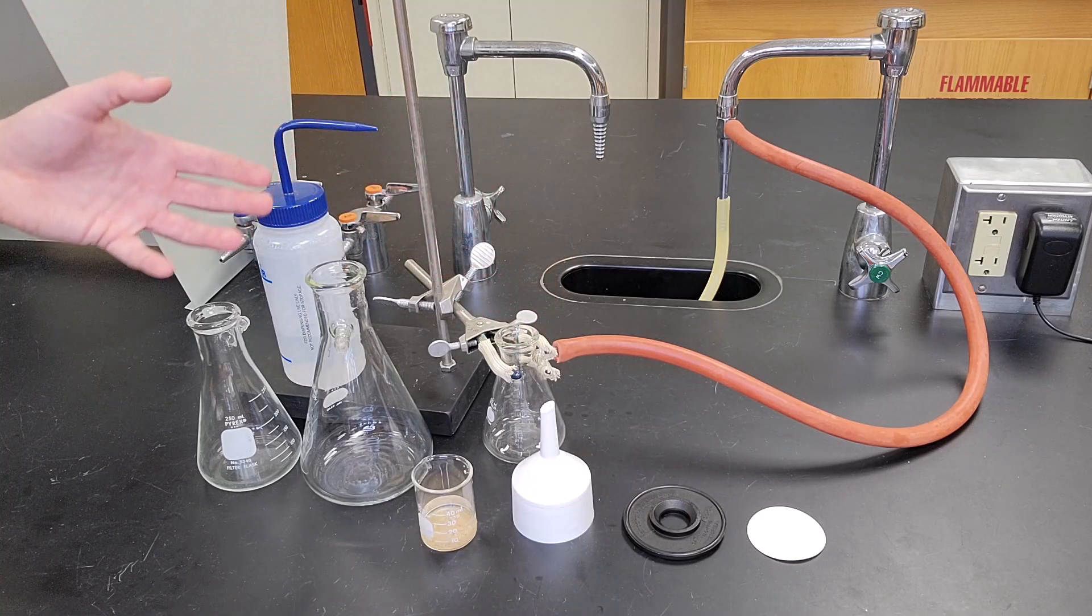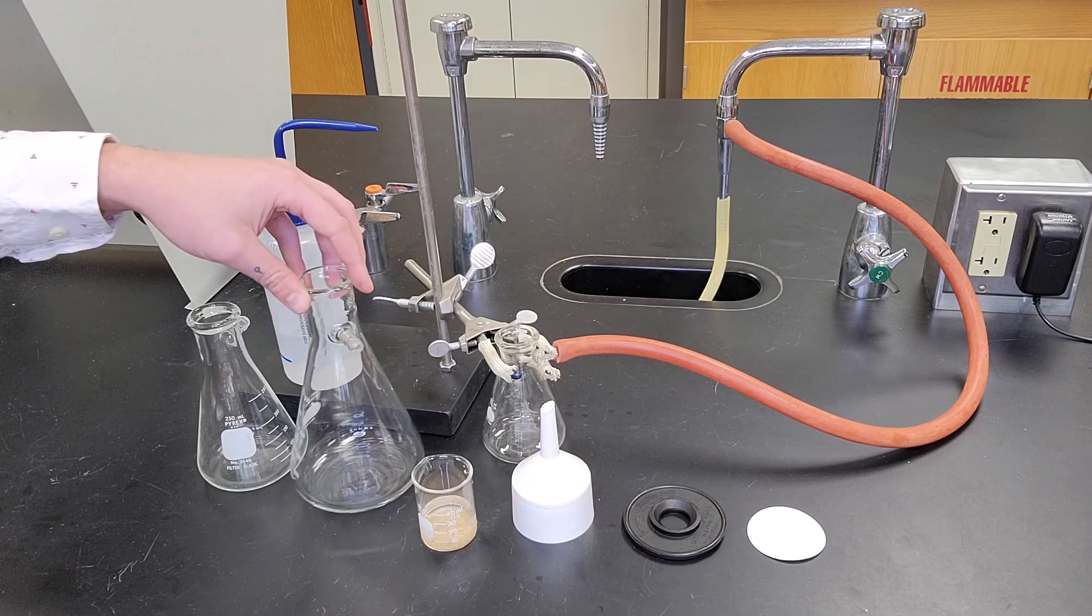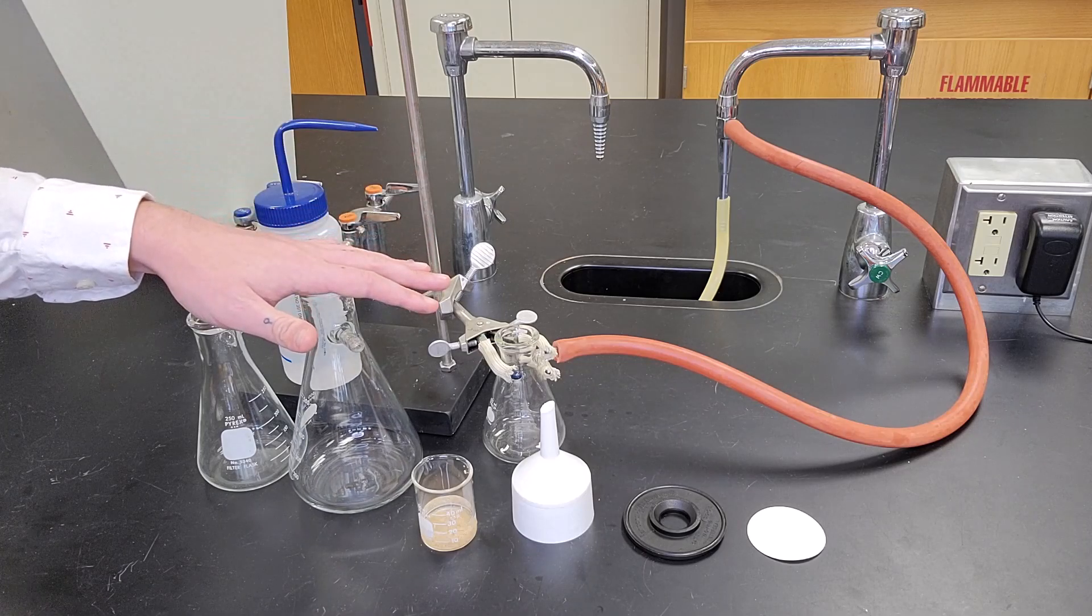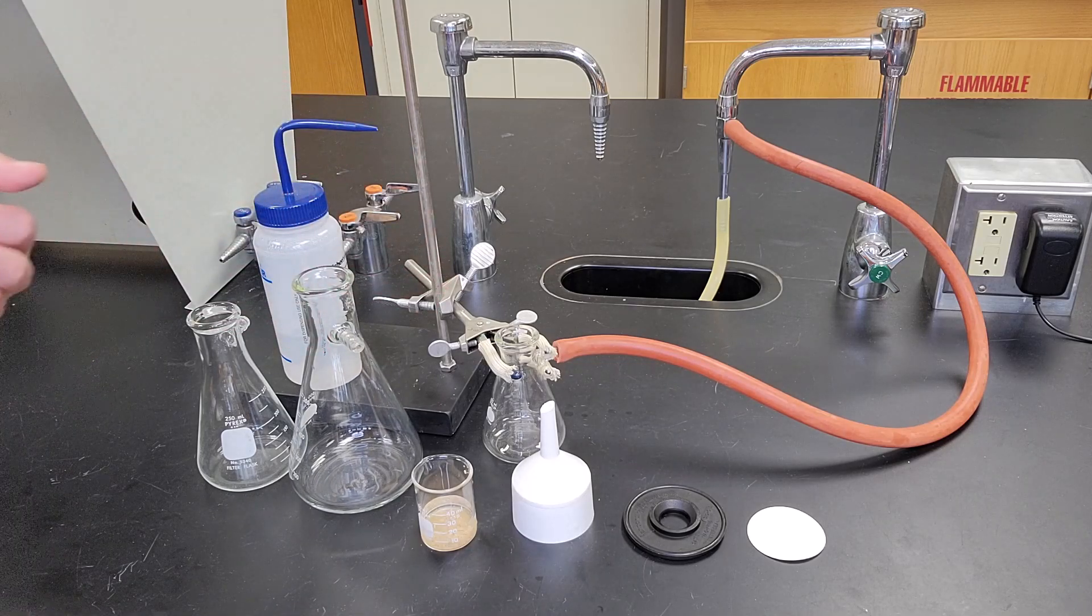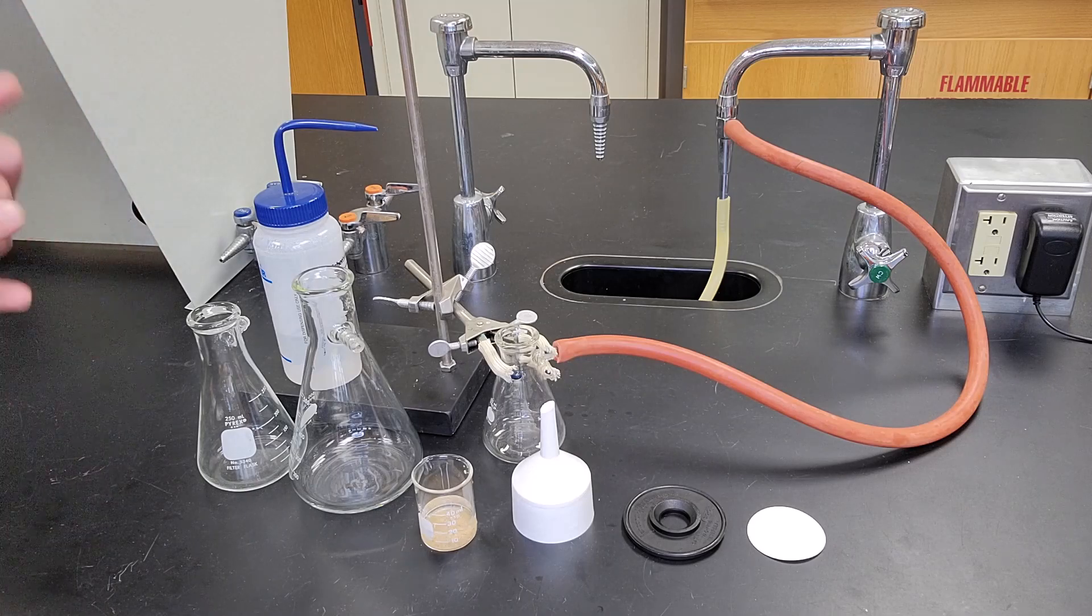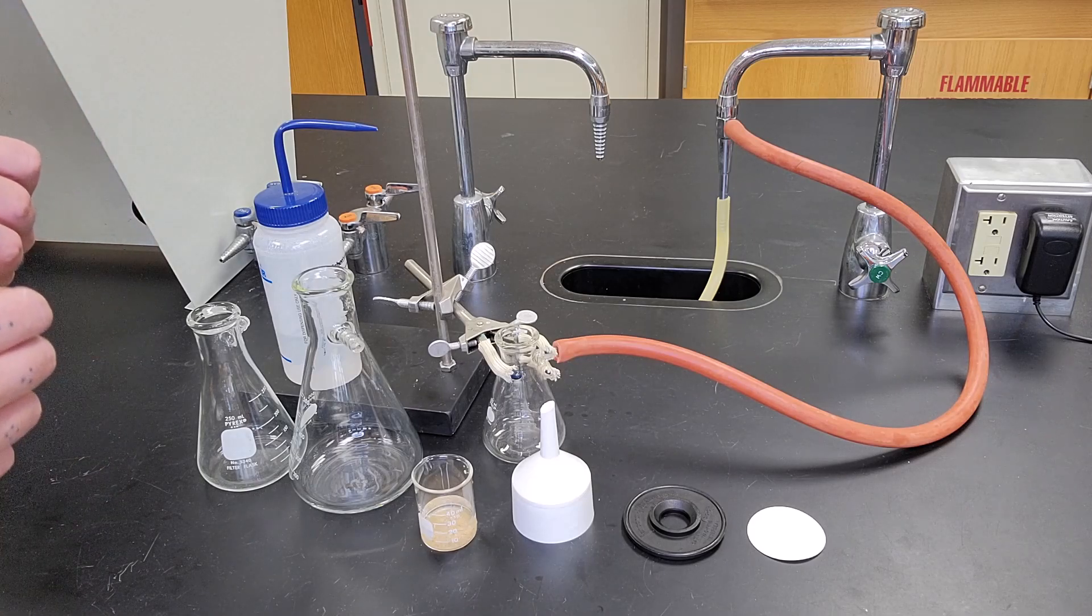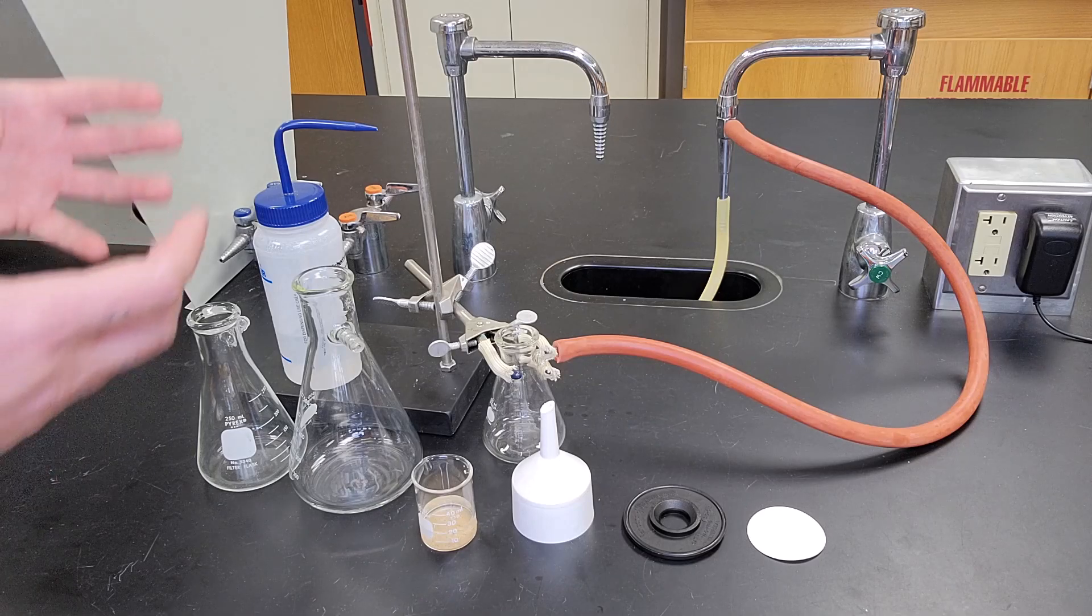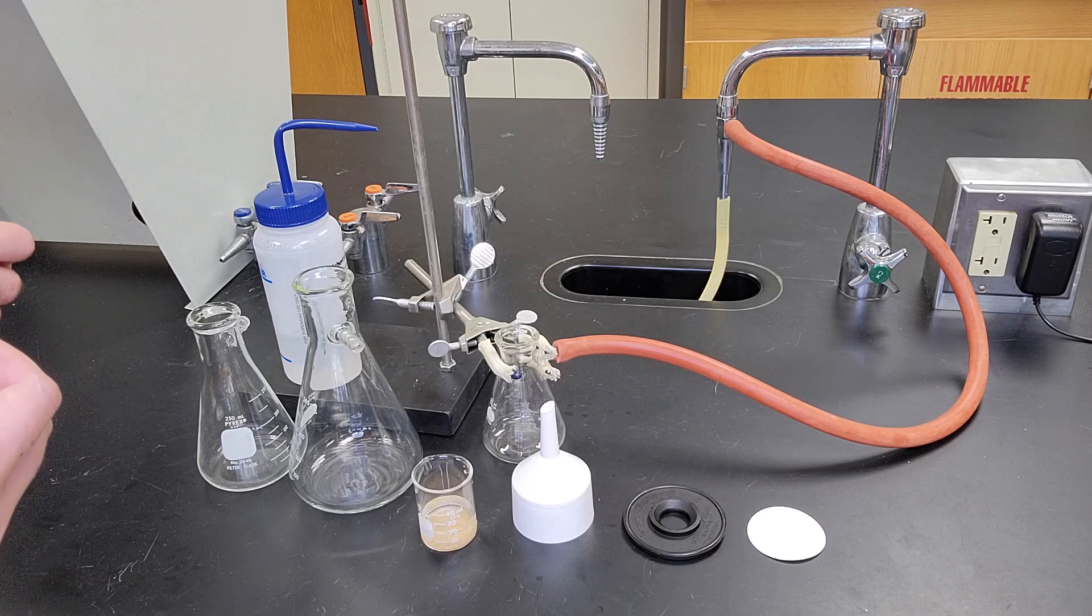If you're expecting 500 mils of fluid to come through your filter, you might want to choose the larger one. Depending on the volume of liquid flowing through, both in your original solution and in your washes, you want to choose the correct size accordingly.